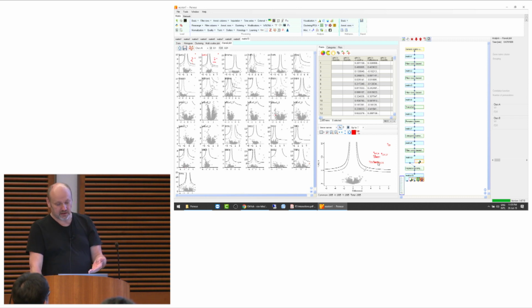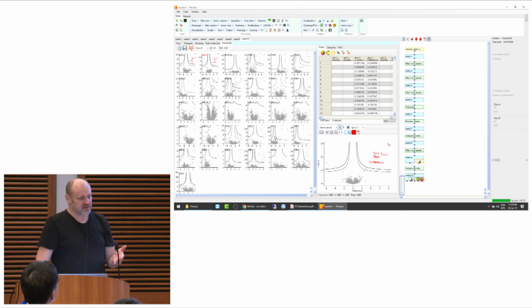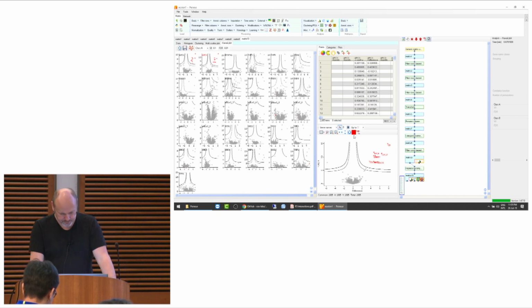But you could also make the selection independent of what the interactors are. So you could also load categories with all kinds of properties of the proteins and select them here. For example, you could come with a list of known complexes or something like this, and then do your selection according to that, right? So that gives you very nice quality control again over your pull downs.